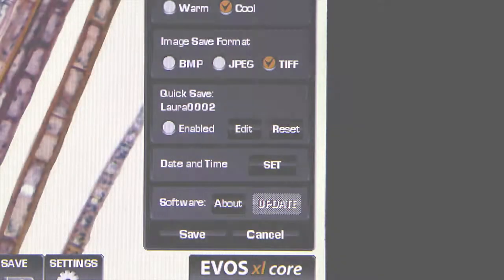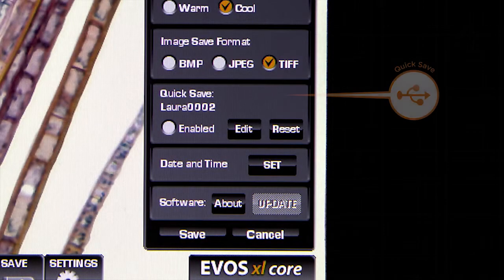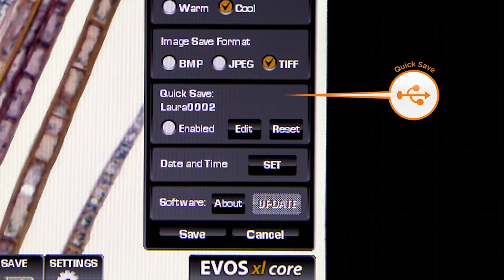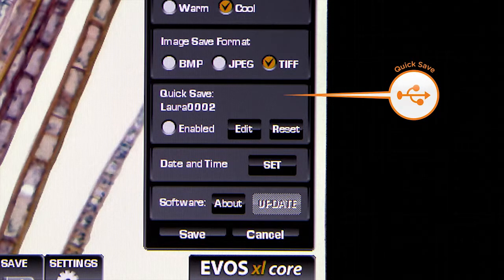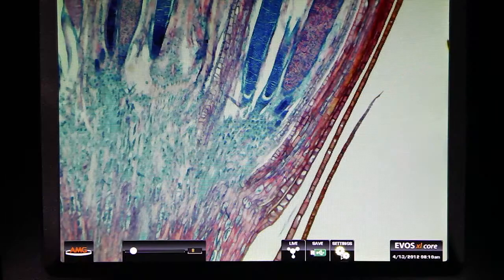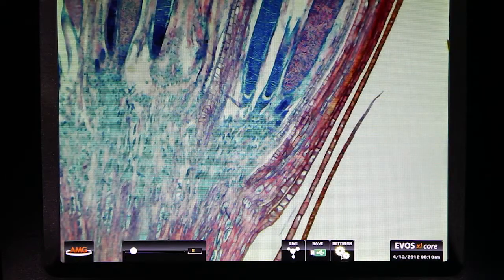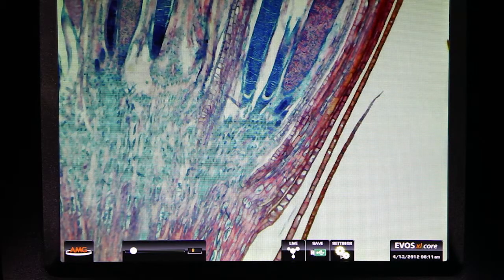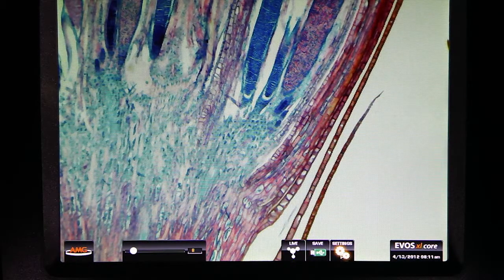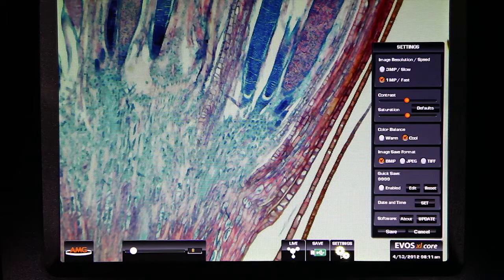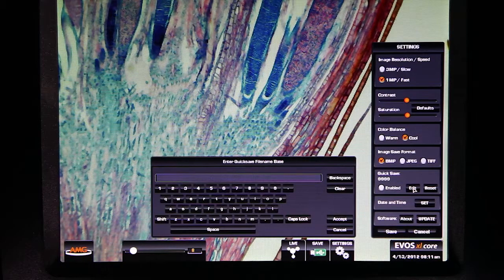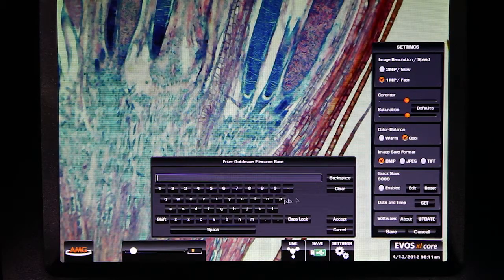You can also save images via a quick save feature. Quick save enables you to set up a base file name in which all of your images will be numbered in the order in which they were saved. To set up the base file name, go into the settings menu and select edit in the quick save option.